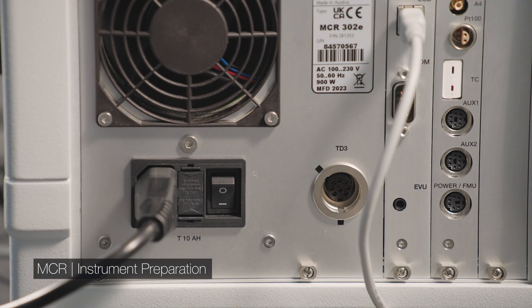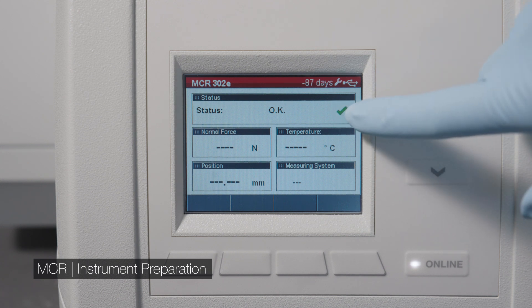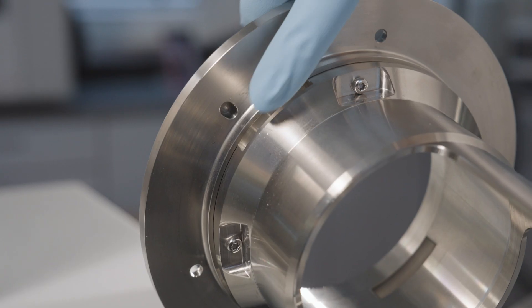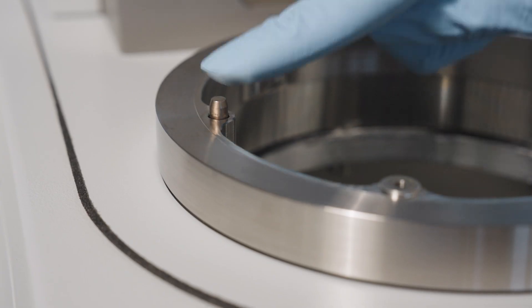Switch on the instrument. Make sure that the compressed air supply is on. Mount the measuring cell holder in alignment with the index pin.